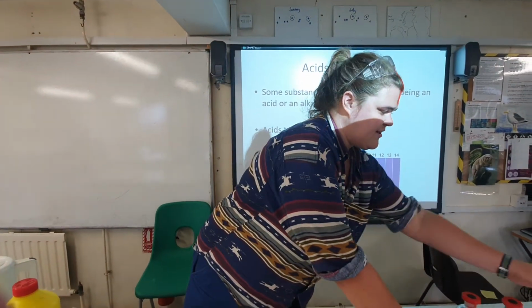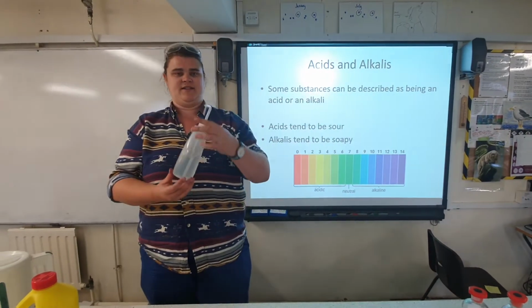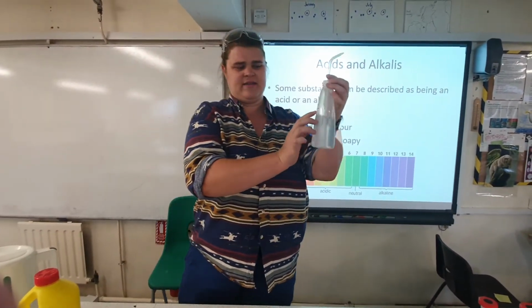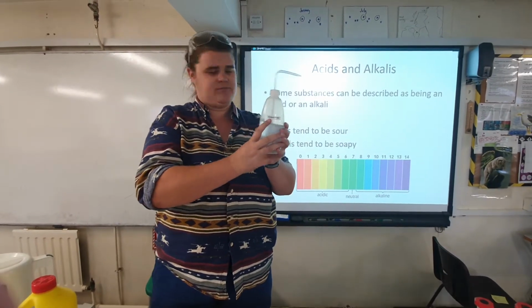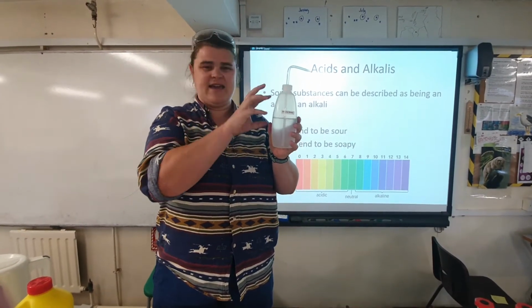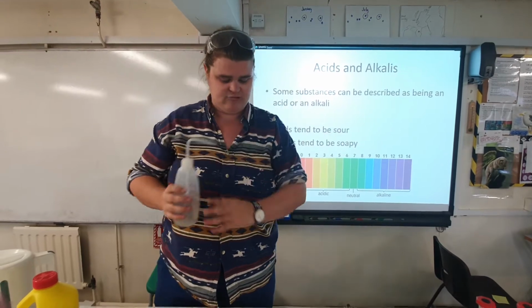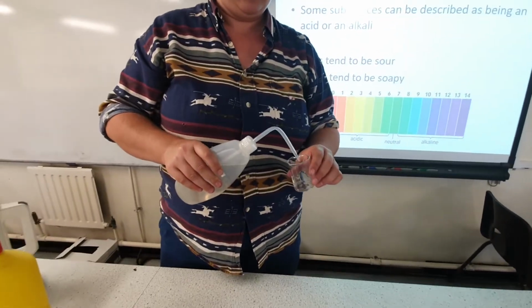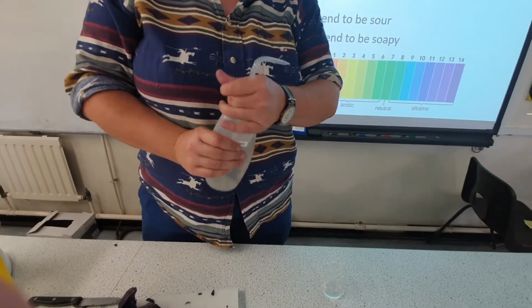We've got one last thing to test with our universal indicator, water. Okay? This says distilled water. That basically means it's really, really pure. It's not just like the water that comes out of the taps, it's just water in here, it's really pure. So, we'll pop a bit of that into a beaker.